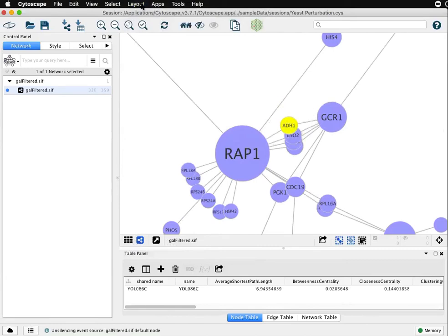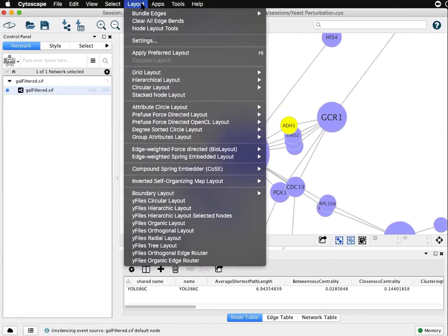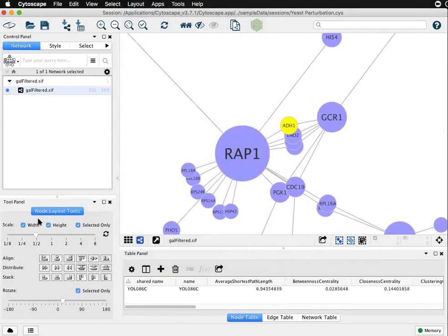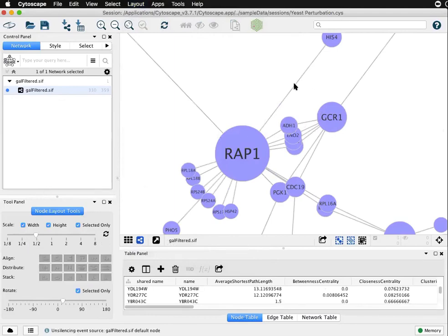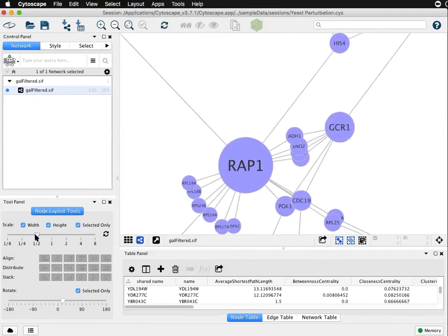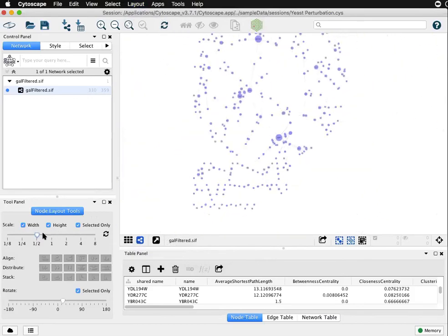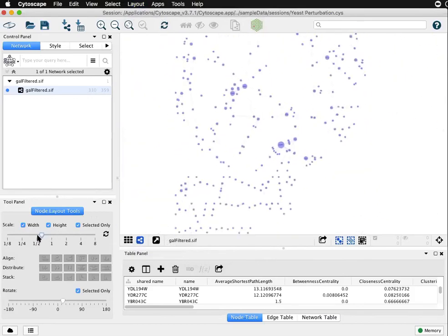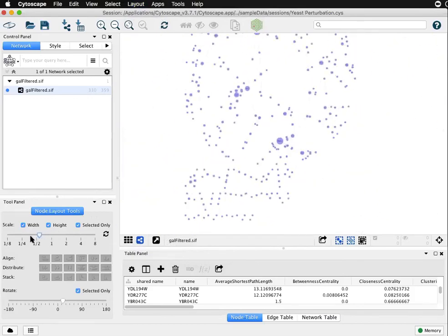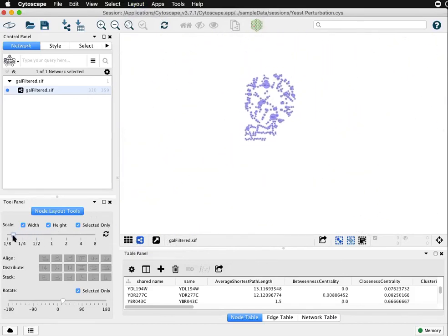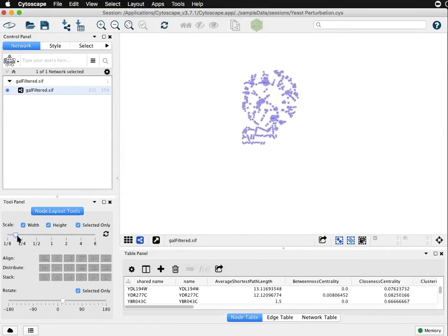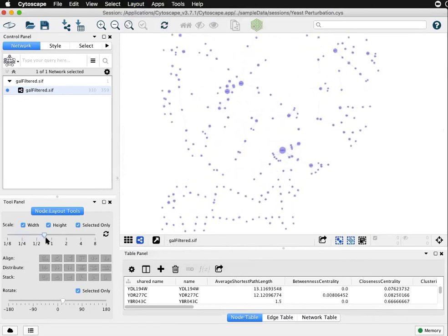Again under layouts at the top, node layout tools, that'll open this extra panel here in the lower left. If I have nothing selected I can use this scaling feature to dramatically expand or condense the layout as is.